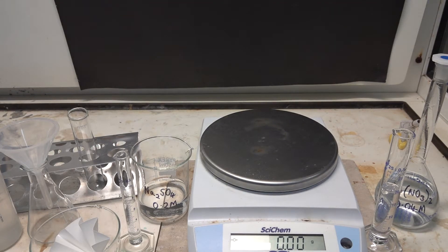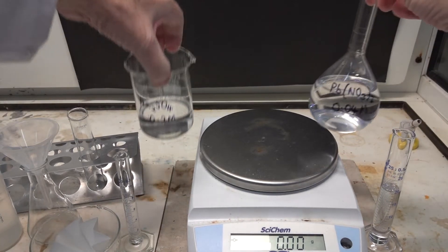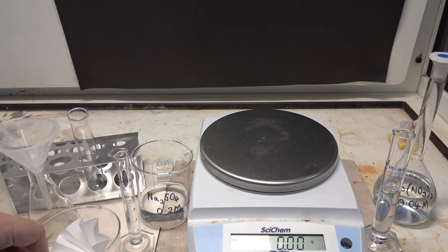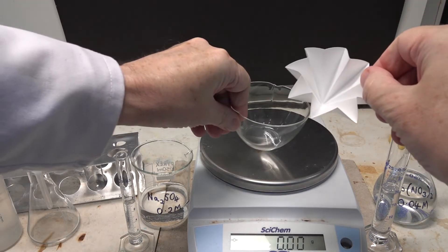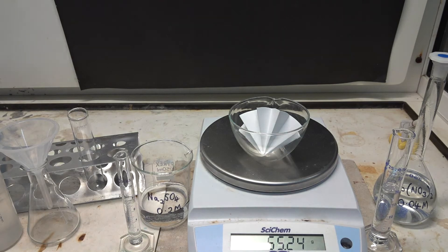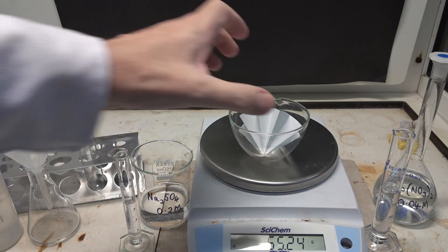Making lead 2 sulfate. In this experiment we'll be reacting lead 2 nitrate with sodium sulfate, but we start by weighing this fluted filter paper in an evaporating basin, and that's 55.24 grams.